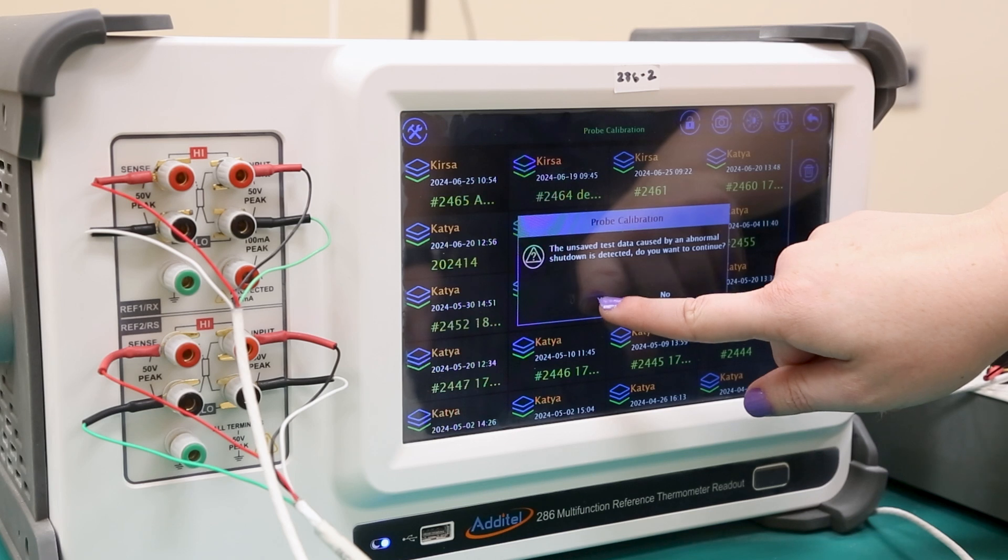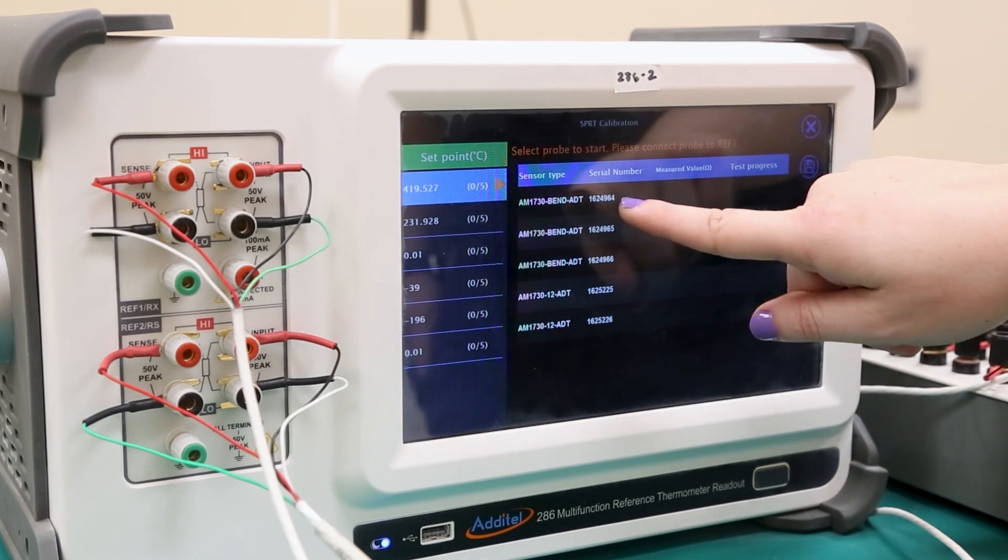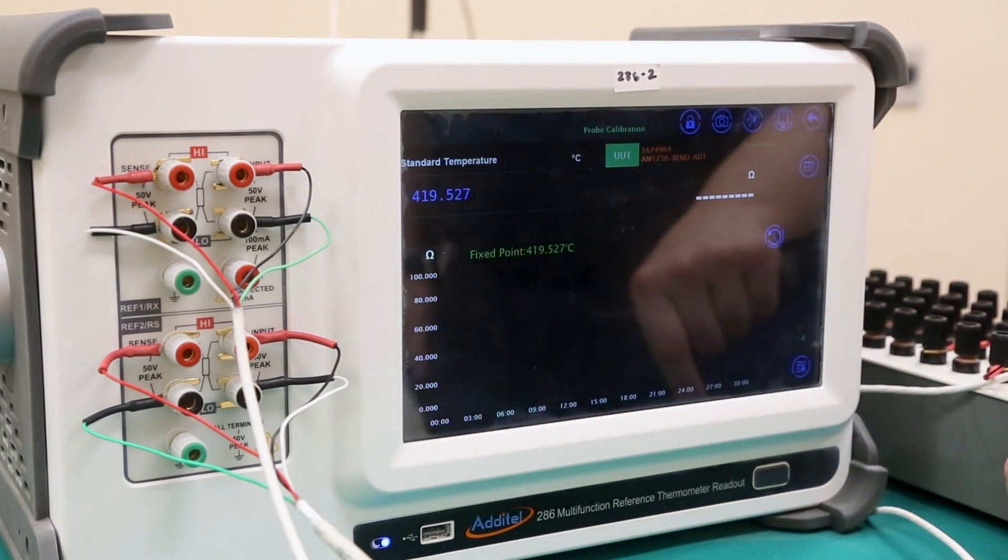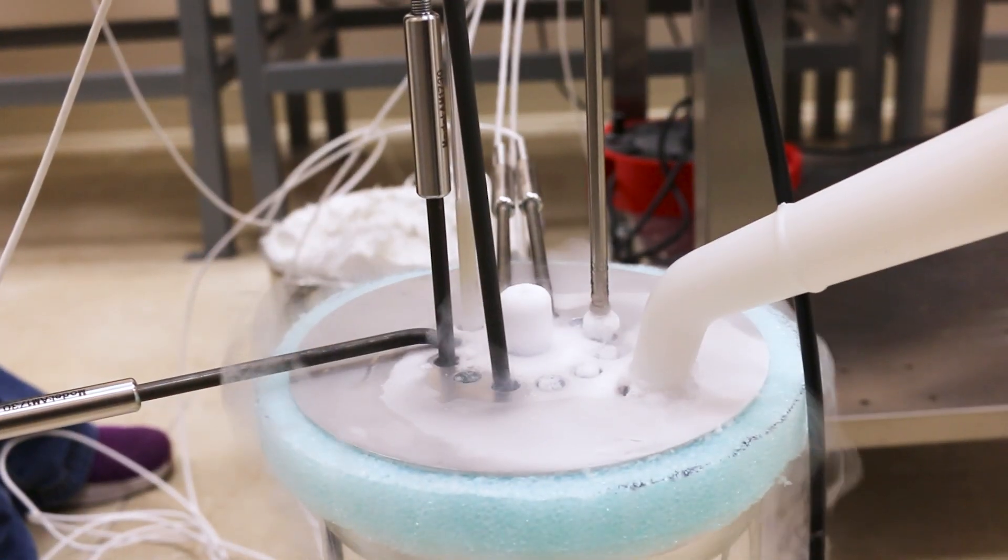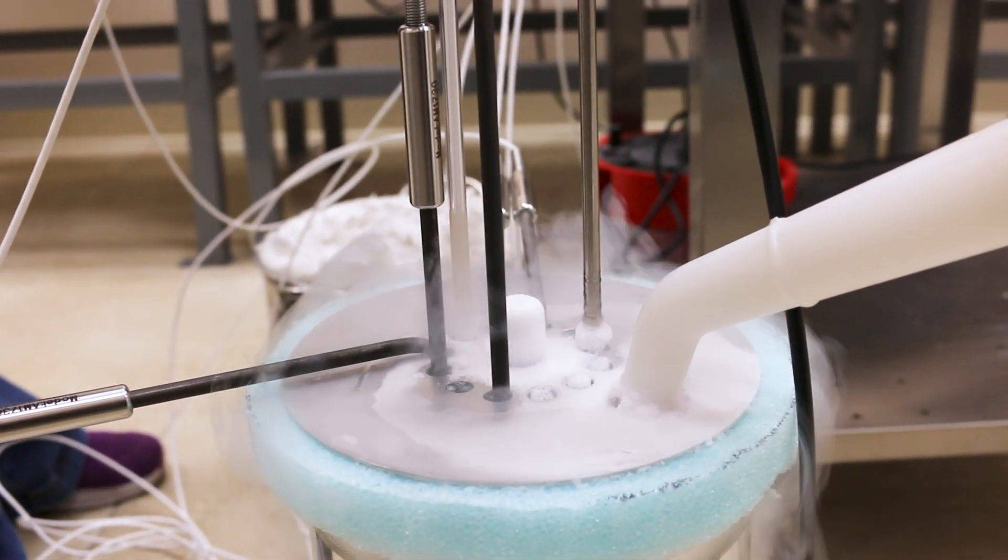This video will take a look at how the Aditel 286 can be used as both a temperature bridge and measurement device to perform a repeatable fixed-point calibration of five different temperature probes with as little user input as possible.